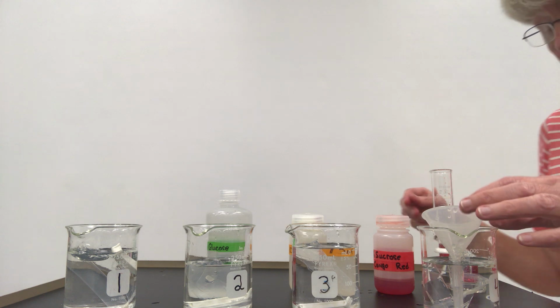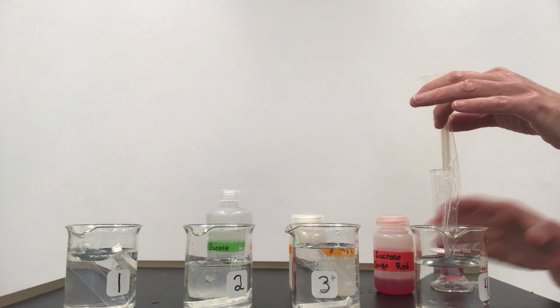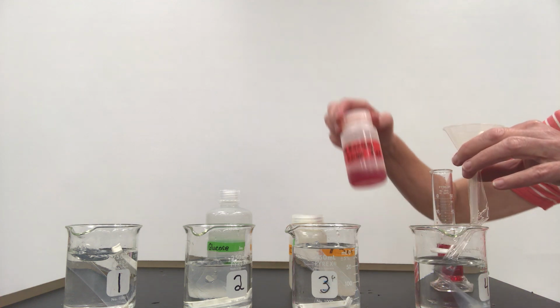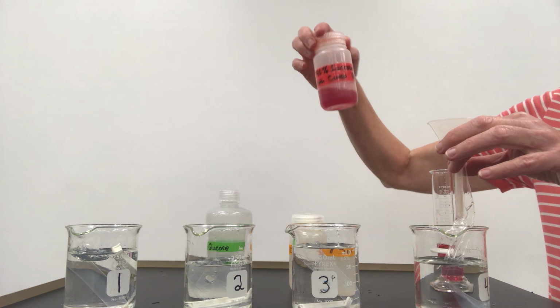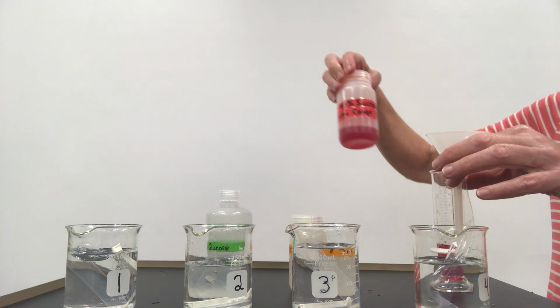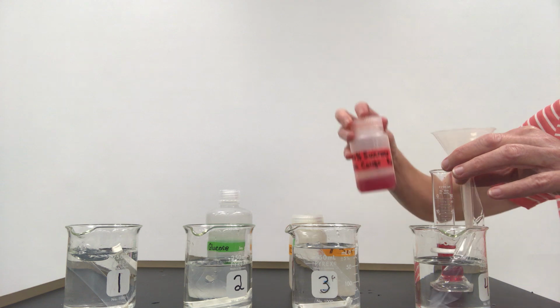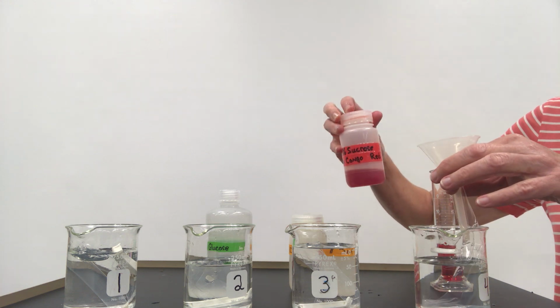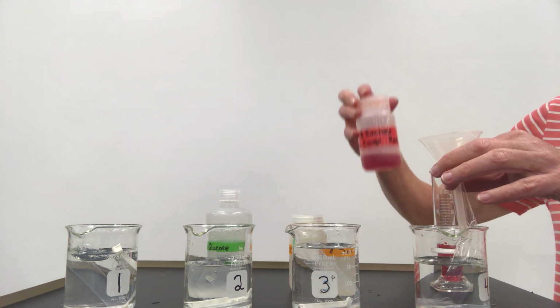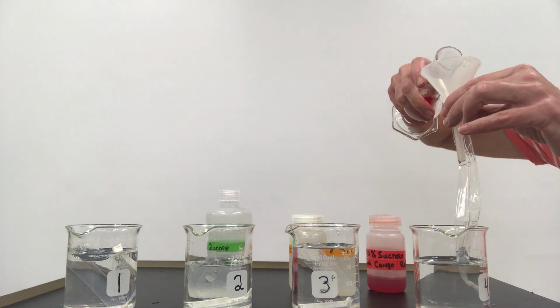And the last one is the beaker. We have it surrounded by distilled water, and we have in this solution sucrose, which is a disaccharide. It is bigger than the glucose, which is a monosaccharide, and this is mixed with a dye called Congo red. So we're going to look to see if the sugar can leave the cell and if the dye, Congo red, can leave the cell.